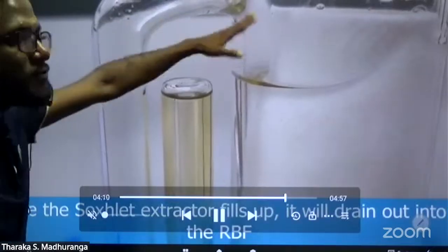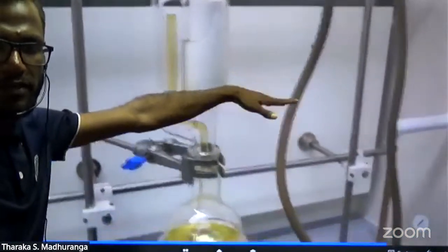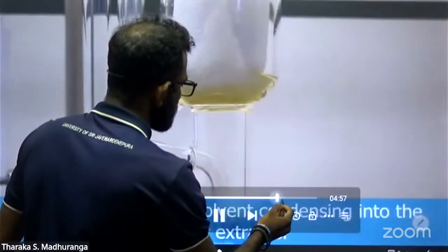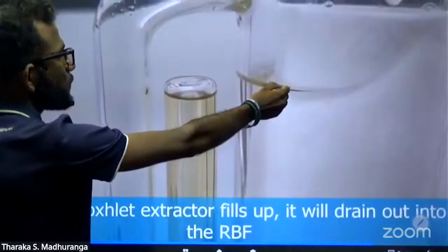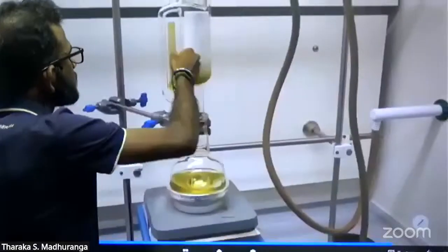Wait, now it is filling. This chamber is continuously filling. After the solvent level comes to this point, see carefully. That is the siphon process.